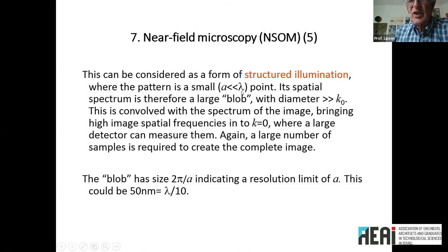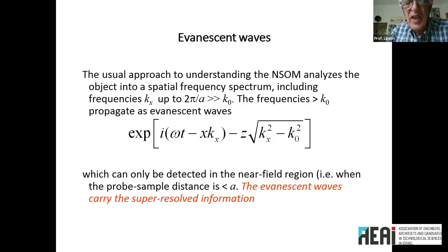This means you have to put a lot of light in order to get a little bit out. This is where the waste of light goes through, and you can get down to about a factor of five at least here. The waves coming out of that sub-micron point source are waves which are mainly evanescent waves, so they don't travel very far.